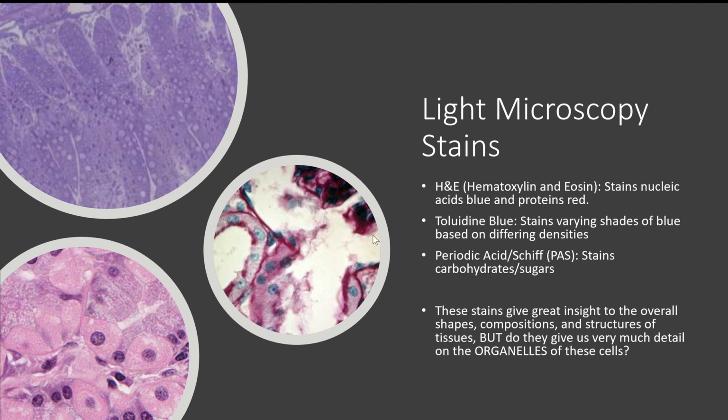Okay, and so it is because these different compounds stain different portions of a cell that we are able to see everything that we see, that allow us to differentiate this cell from this cell, this nucleus from the cytoplasm of the cell, okay, and so on. So that's H&E, that's the most common one, and it is normally going to look very pink and purple dots are what you guys are going to see a lot of.